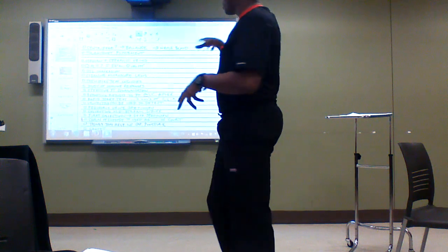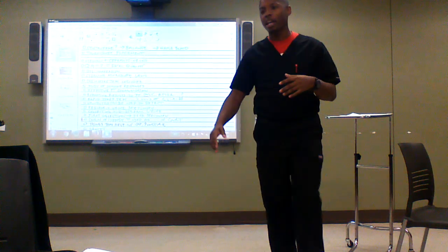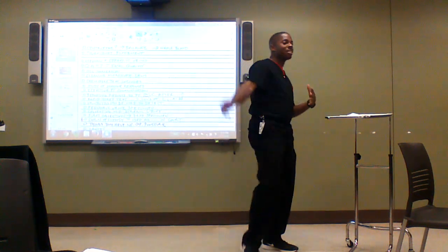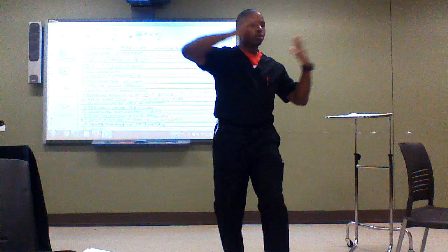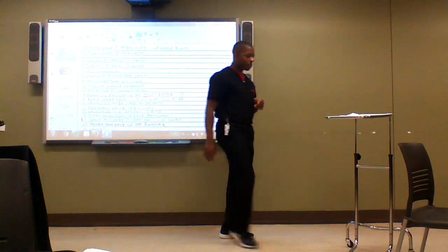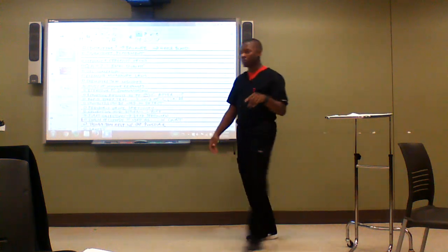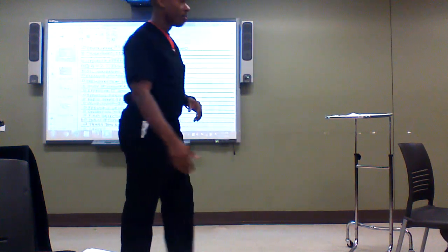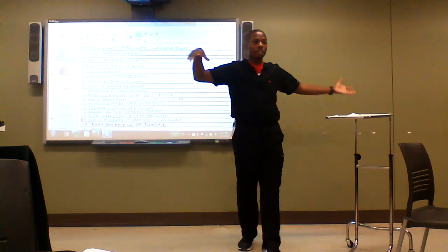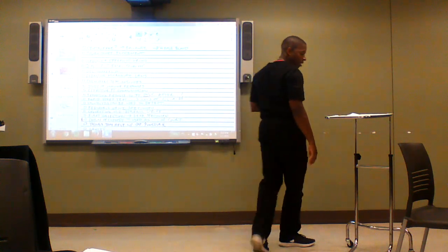Let's talk a little bit more about the centrifuge because we're going to have a couple of questions about that, and we've gone through it already. When talking about the centrifuge, we need to know that it spins down to separate the solid from the liquid, particularly the cellular and liquid portions of the blood. When we're talking about blood, it's separating the cells and the liquid, because the cells are really the solids. I already told you about counterbalancing.